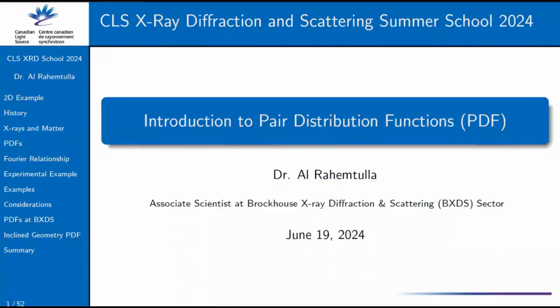Yeah, I spent a lot of my grad school learning and doing a lot of work with pair distribution functions. So we figured it'd be great for me to give you guys an introduction on this PDF method that's really useful for a lot of difficulties when powder diffraction can't quite cut it, either because of the sample or because of what you're interested in.